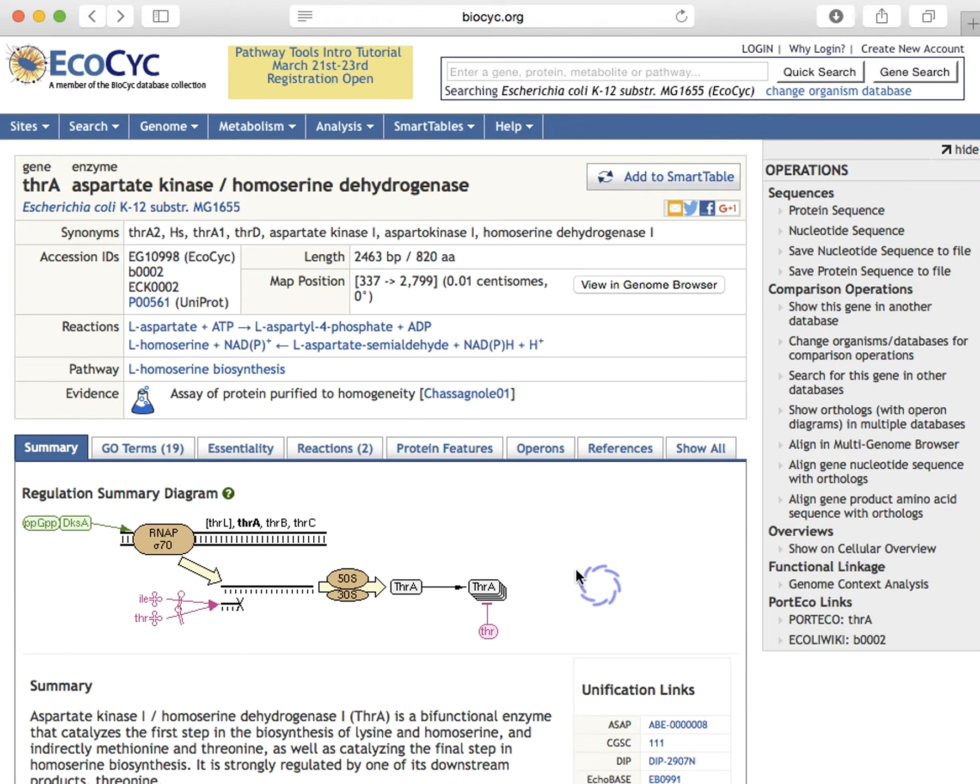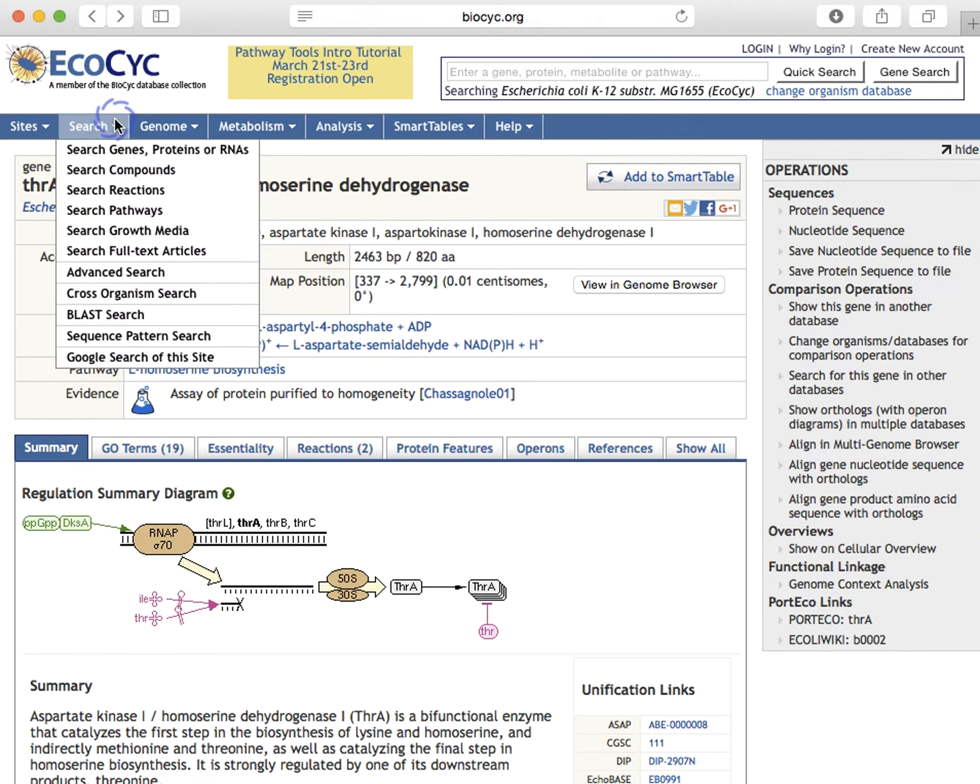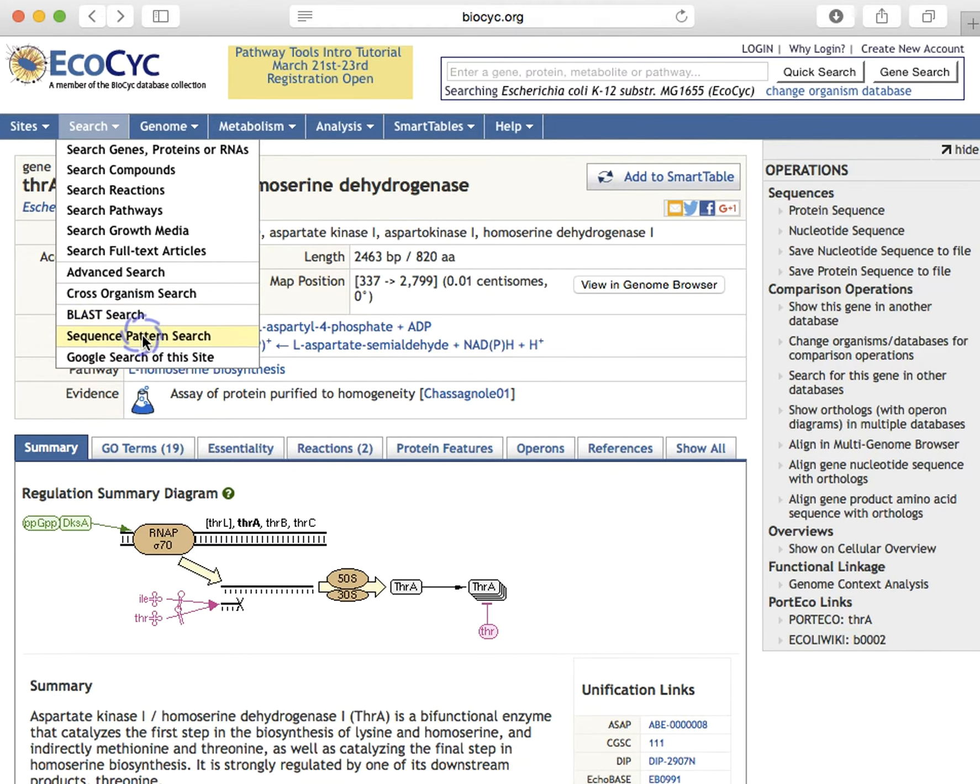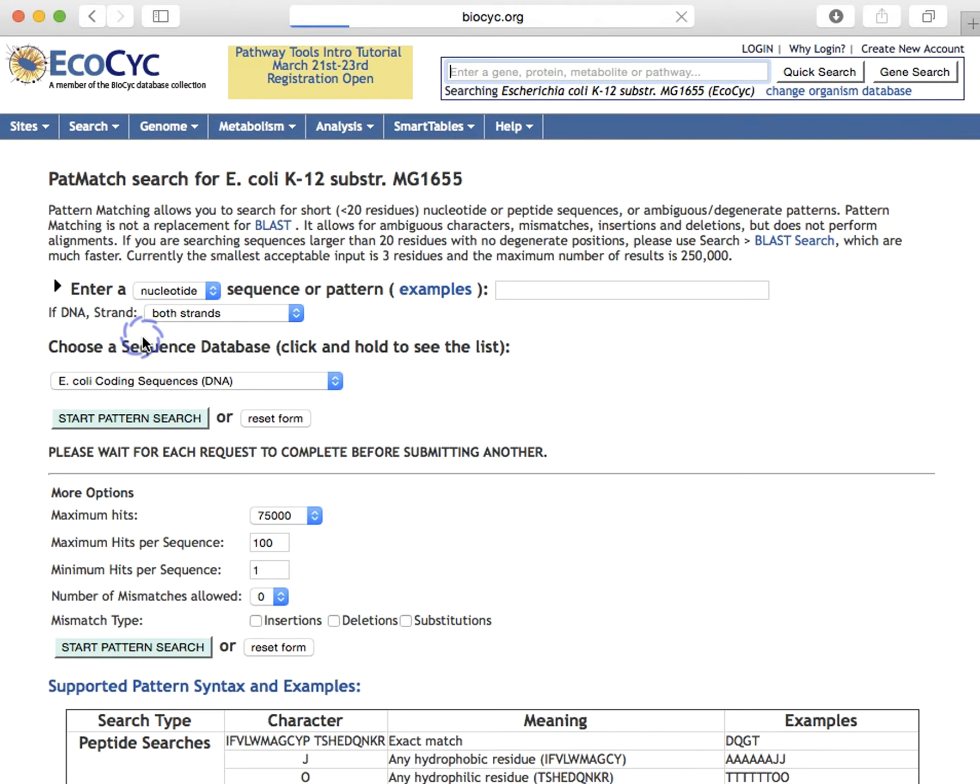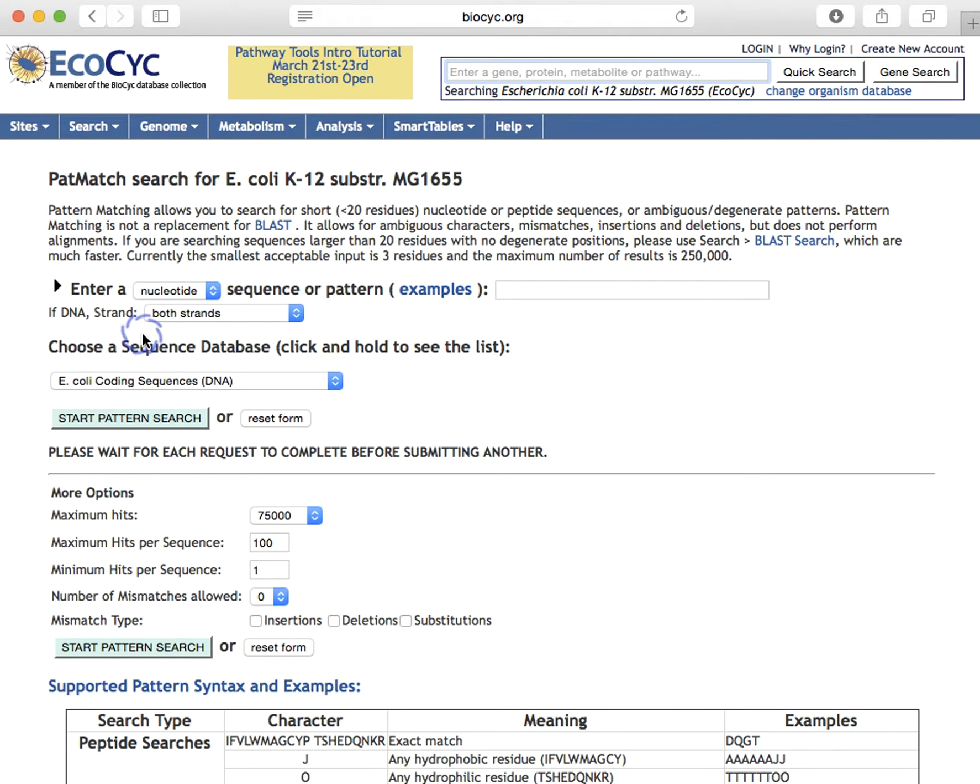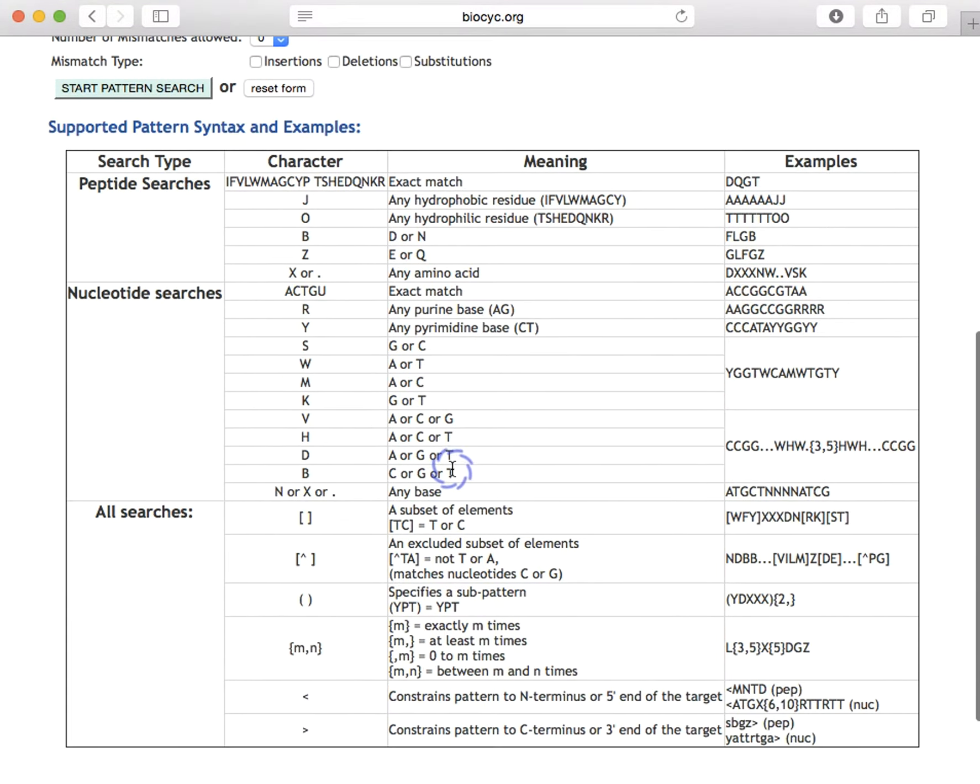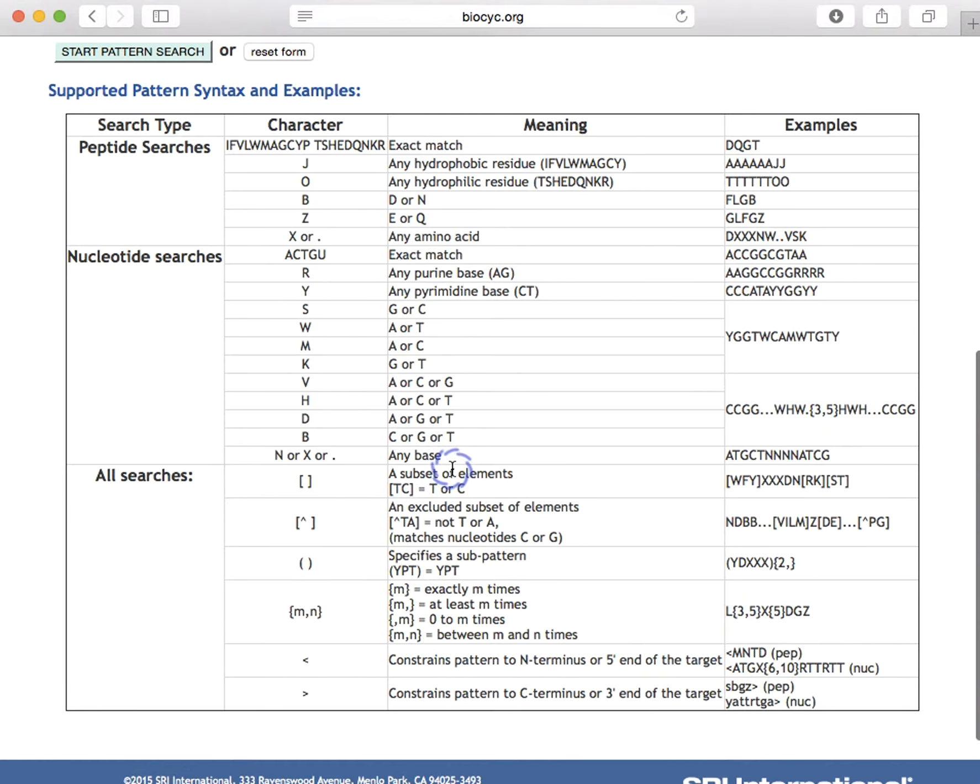BioCyc supports two types of sequence searches under the search menu: BLAST searches here and sequence pattern searches. The BLAST search tool is pretty standard, so we're not going to spend time on that, but let's look at the pattern search tool, which makes use of a software program called PatMatch. PatMatch allows you to search for short patterns only, less than 20 characters, and the pattern language is described in this table at the bottom of the page.